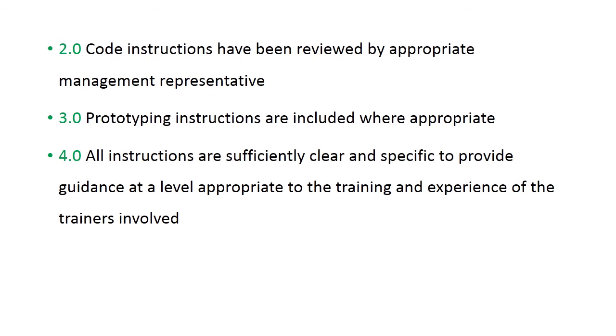So they will hire some external agency, or employ some software expert, in order to review the codes generated to prepare software for LIMS. So an external representative authorized by laboratory management would examine the final coding document and give approval.